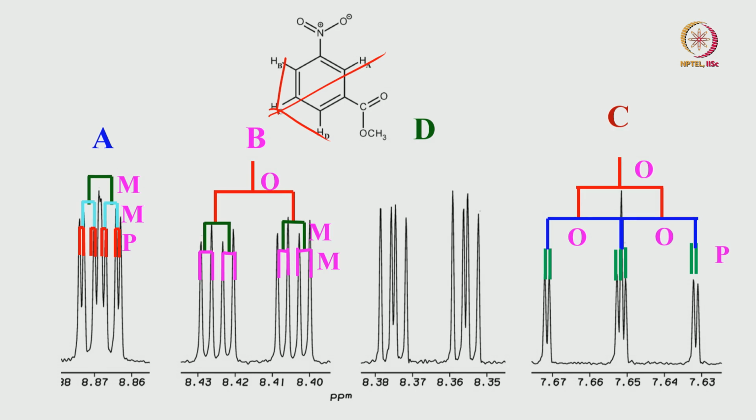Actually, in principle, there is a resolution here. If you carefully see, it is not overlapped. So, it is an 8-line pattern.